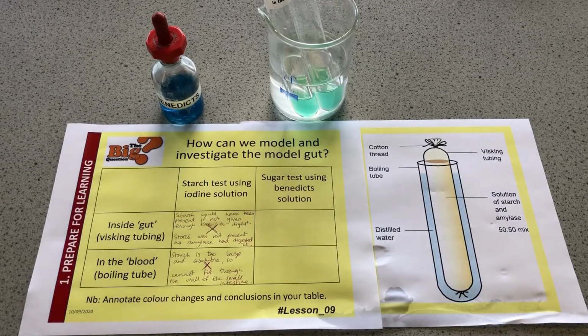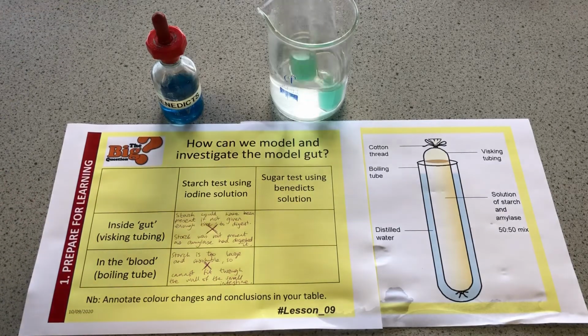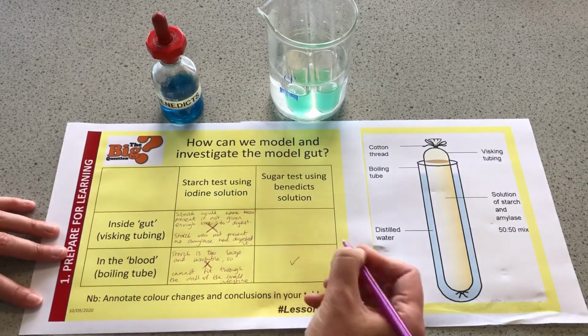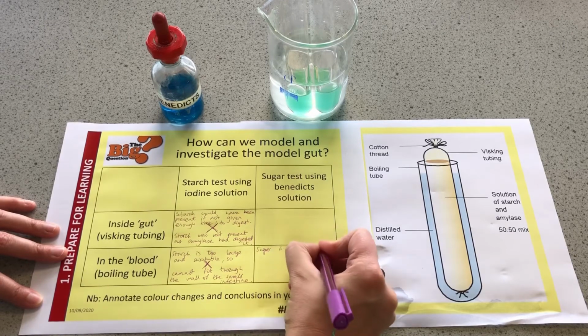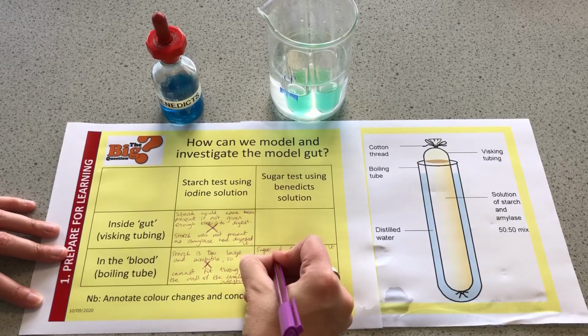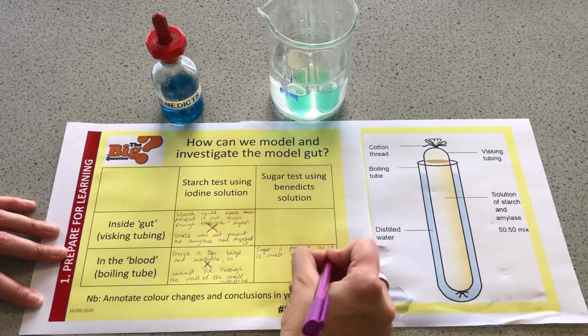We now have our results from the Benedict's solution sugar test, and as you can see in the blood we've got that colour change, so we've gone from blue to green, saying that yes, there is sugar in the blood. Okay, so I'm going to give that a tick, and sugar is present as it is small and soluble.